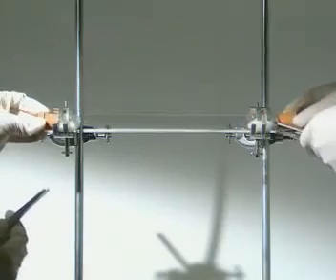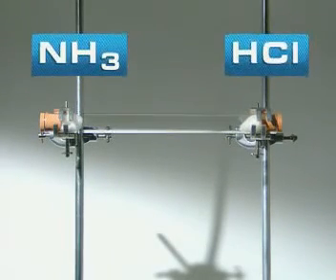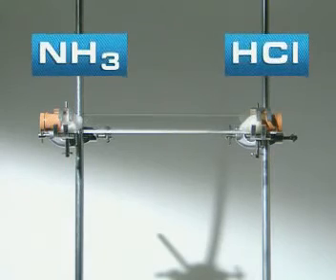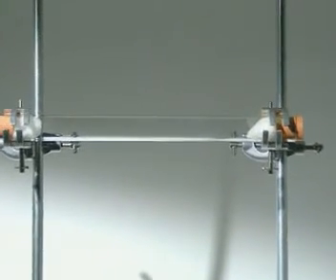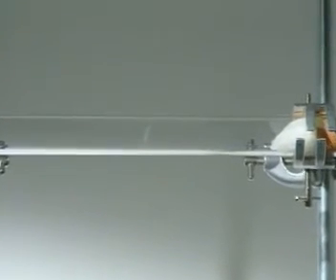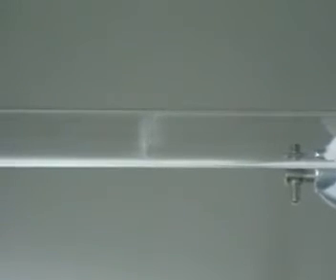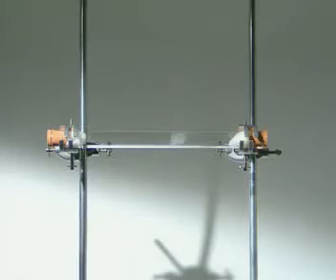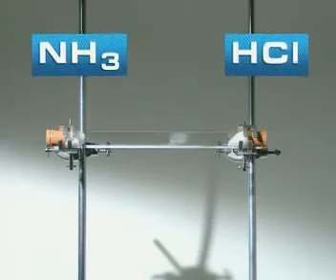Place the two pieces of cotton wool at opposite ends of a tube and the gases spread out. You can compare the speed at which they approach each other by looking out for a cloud of ammonium chloride. After less than a minute, a white ring begins to form, marking where the gases meet. The white solid is closer to the hydrogen chloride end of the tube, on the right. So which gas has travelled faster?